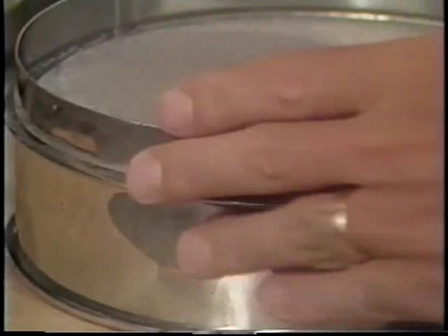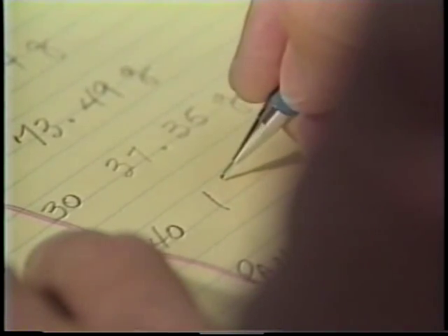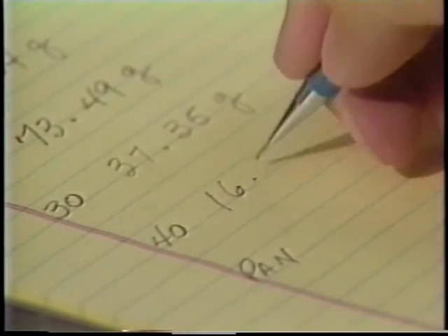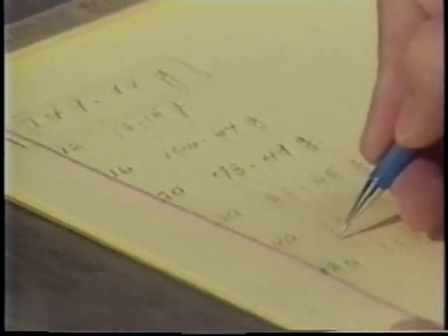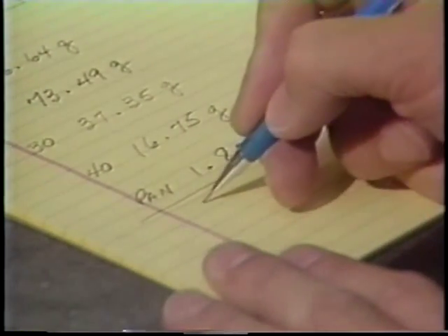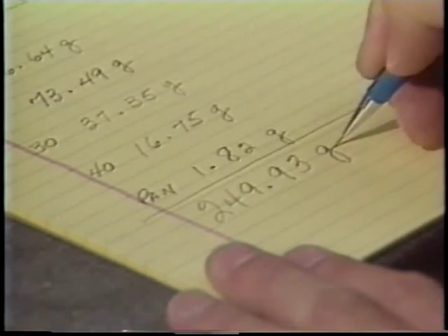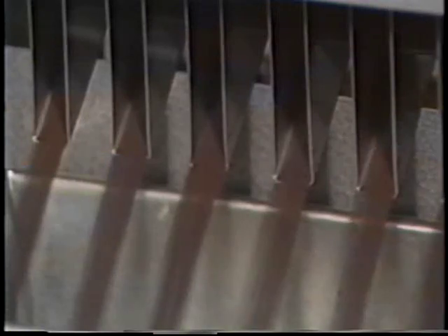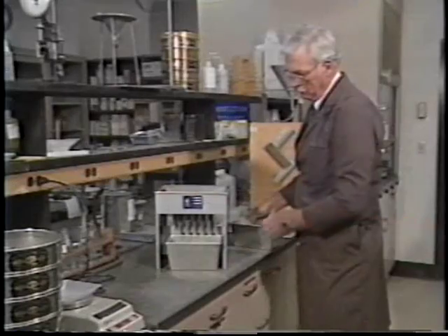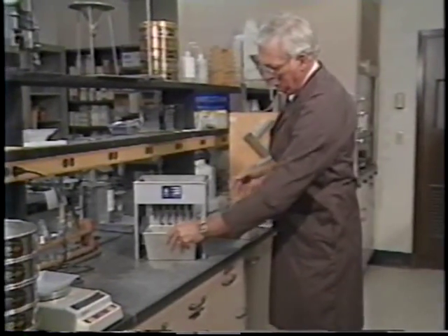This full sampling procedure may seem overly precise, but each step is vital to an accurate, representative result. The processing of roofing granules — 3M takes great care to assure that the grade and color delivered to customers is precise. The sampling procedure you have just seen is representative of the sampling we perform to assure the grades of our product. To be accurate, you must take a careful, representative sample.